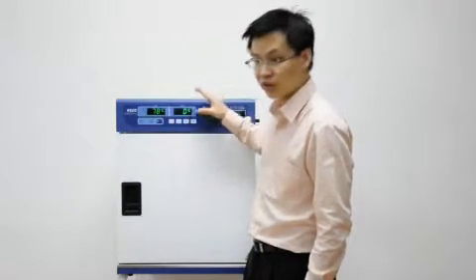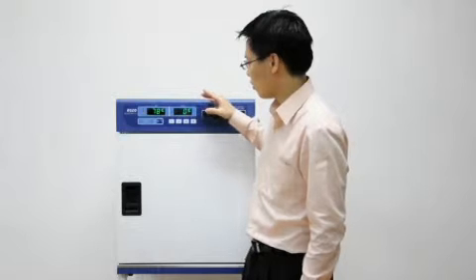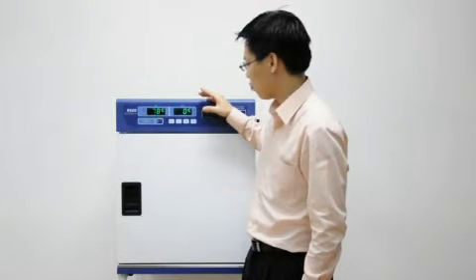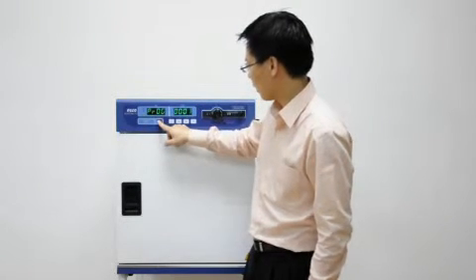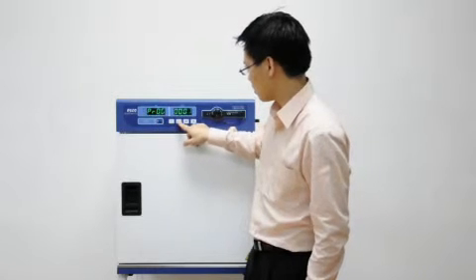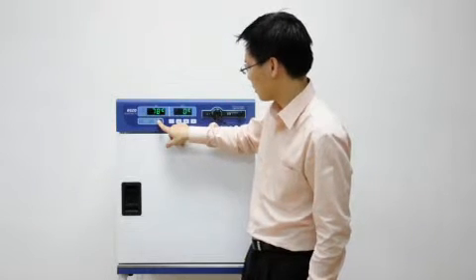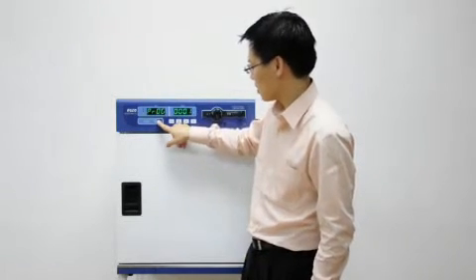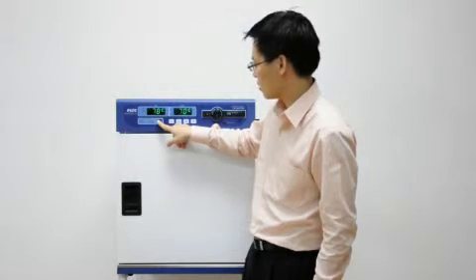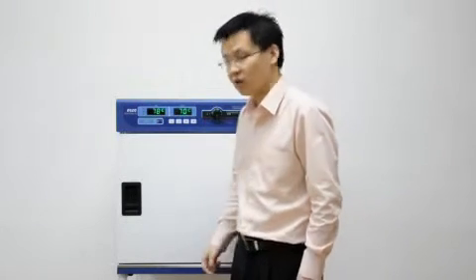So assuming I have configured the temperature and duration settings for program one, what I can do now is to select program one, and to operate program one, I have to press this key and hold down for five seconds. So now program one is in operation.